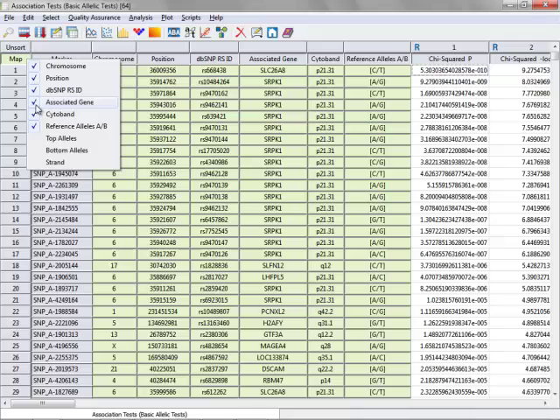So now you can see that the most significant SNP is located on chromosome 6. It's got its RS number here, associated gene, and cytoband.